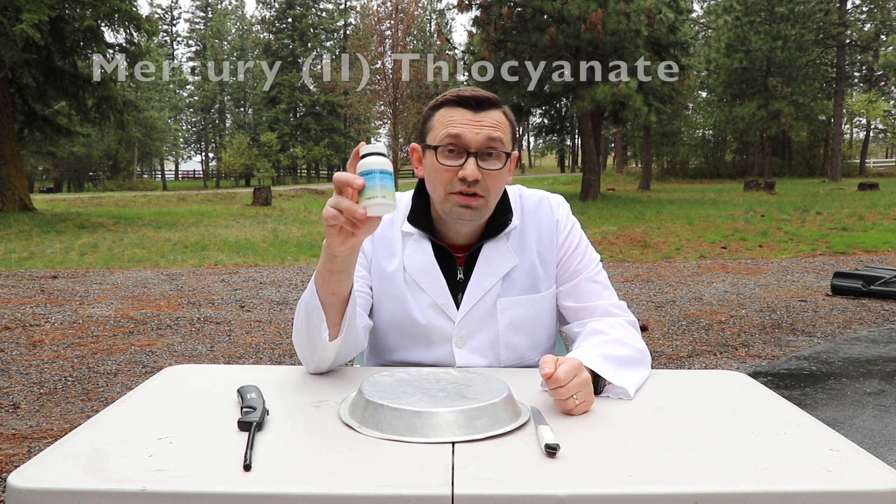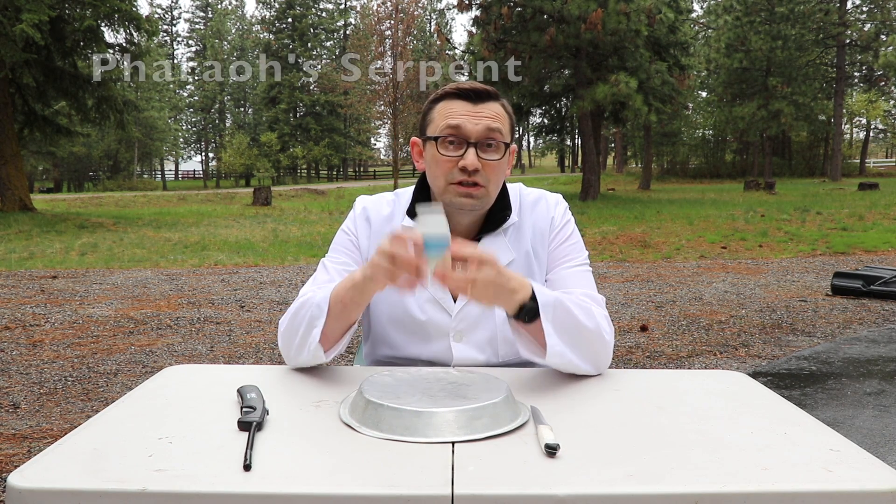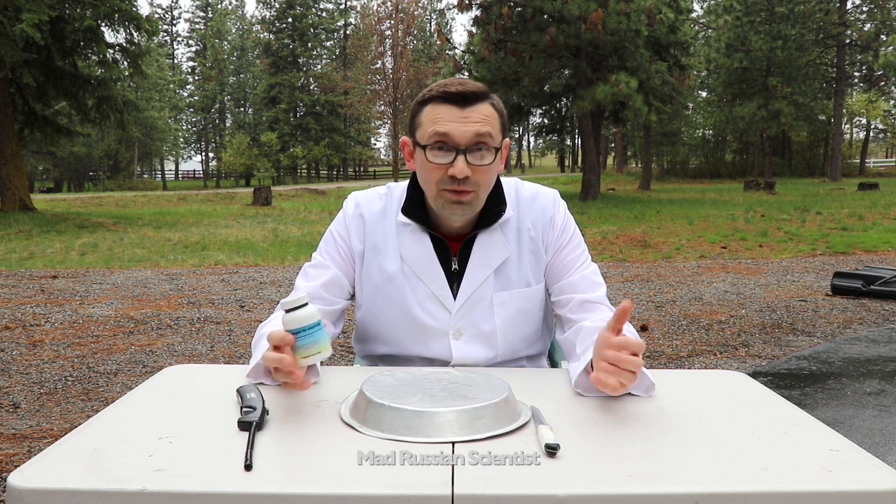Hello my friends, how you all doing? I ordered mercury thiocyanate online and this chemical makes a really cool reaction when you burn it. It's called pharaoh's serpent. So what I'm gonna do, I'm gonna burn it and we'll see how cool it is. Let's check it out.